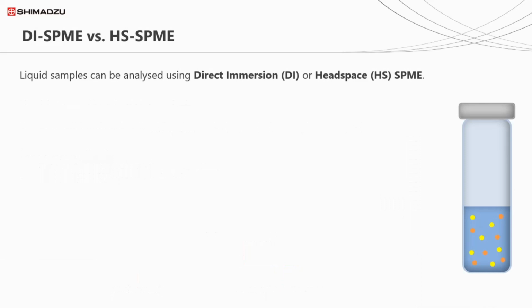One of the nice things about SPME is that liquid samples can be analysed in a similar way to headspace, known as headspace SPME. But they can also be analysed by direct immersion, where the fibre is submerged in the liquid sample itself.